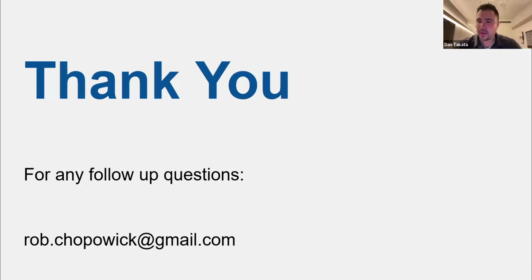All right, thank you. Let's go with one more. Is there any push to make airflow disruption mandatory in the states? This might be incredibly important to identify any micro exposures. It's hard to say if there's any push. I can tell you from the ASHRAE committee right now, our push is not on those robust or dynamic challenges. Our push is on alternatives right now.